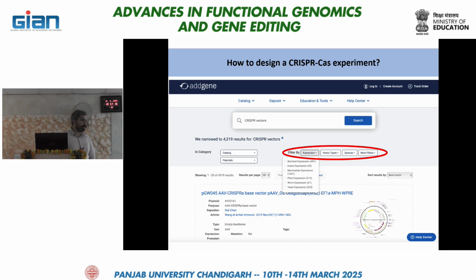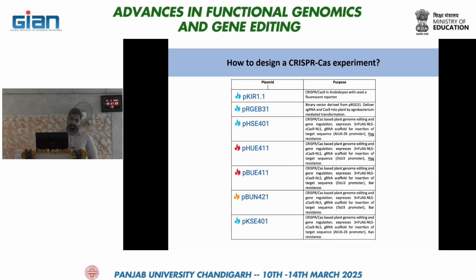Some of them have Cas9 as endonuclease, and some have Cas12, and you can further search it down. Based on this, you can select a particular vector which will be required for you.